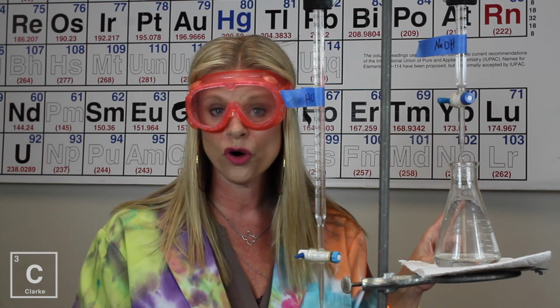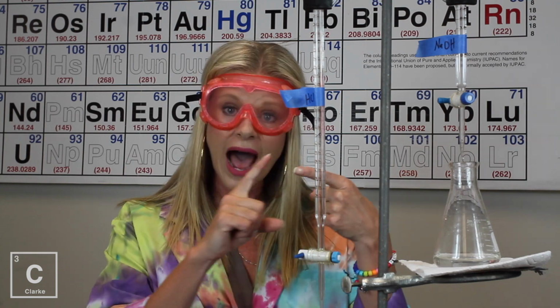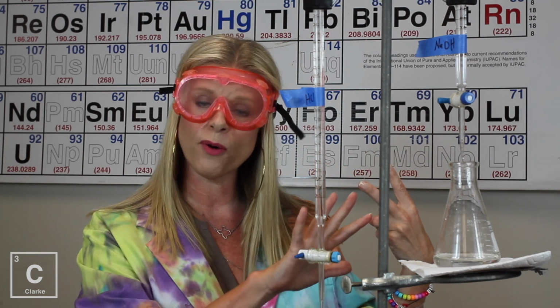I'm going to show you the mathematic formula that we're going to use to figure out that unknown concentration, but it looks exactly like the dilution formula from that unit before in solutions. We're going to have the molarity times the volume of the acid, and that's going to equal the molarity times the volume of the base. I know the molarity and the volume of the acid. When I get finished with this process, I'm going to know the volume of the base. Then I can solve for that unknown, the molarity of the base. Let's go through this titration.